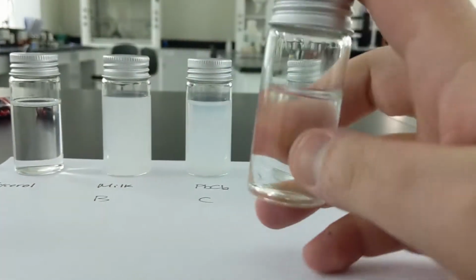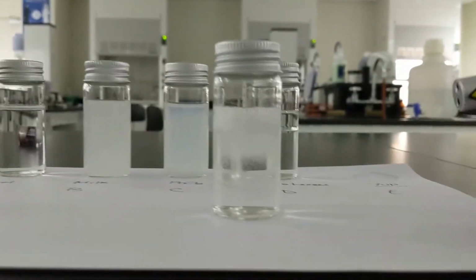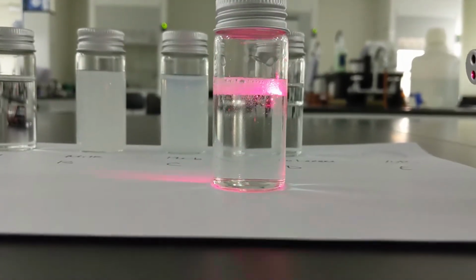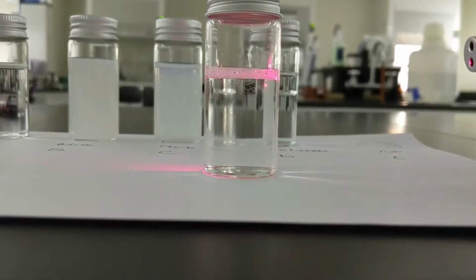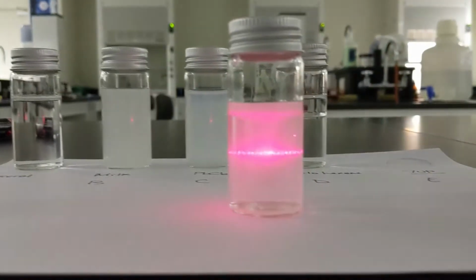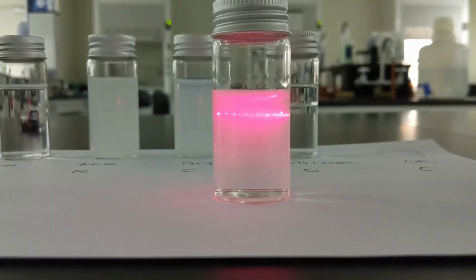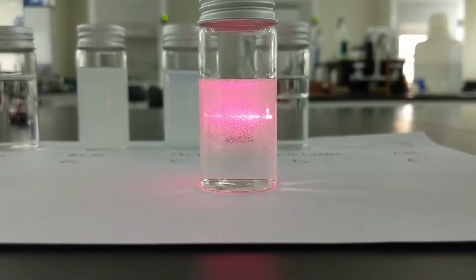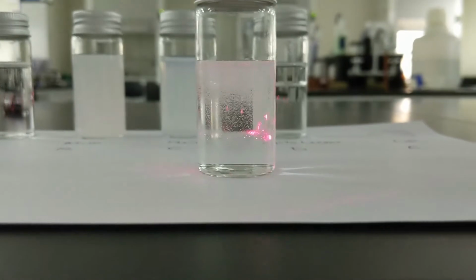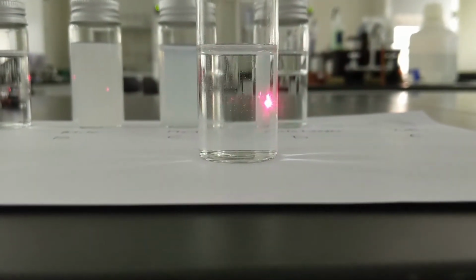But one interesting thing that I can do with 7-Up is shake it. And it's full of carbon dioxide. So now when I shake it up, you can see a little bit of the Tyndall effect with that carbon dioxide as it escapes that solution. So this is a really interesting phenomenon. As I let this sit, the Tyndall effect stops working.